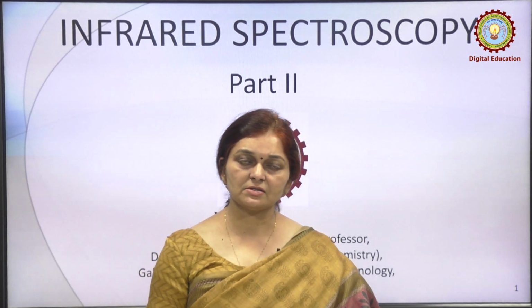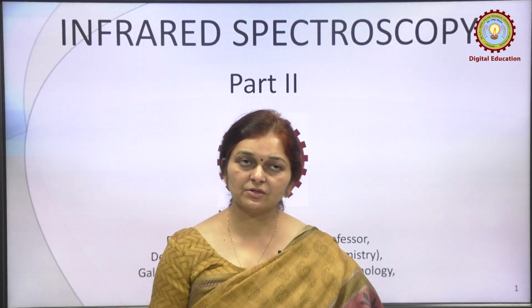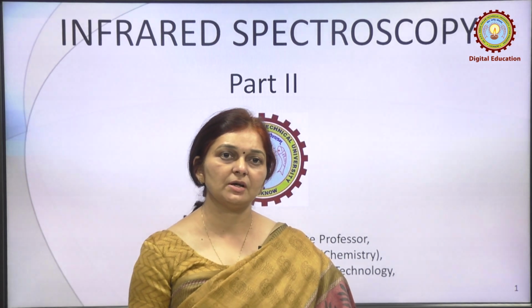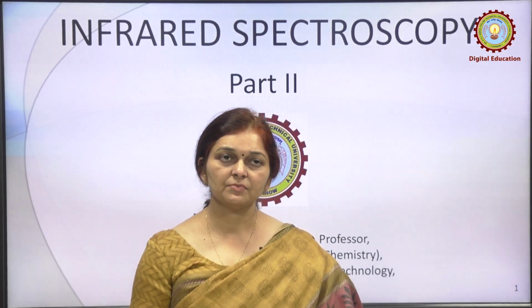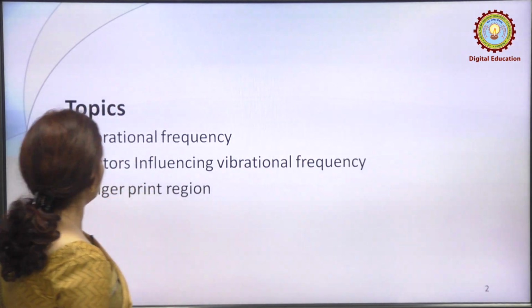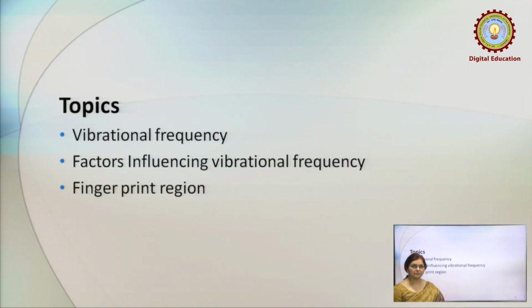In the previous lecture, we have learned about the molecular vibrations, number of fundamental vibrations, and how we calculate fundamental vibrations. In this lecture, we are going to discuss the following topics: vibrational frequency, factors influencing vibrational frequency, and the fingerprint region.